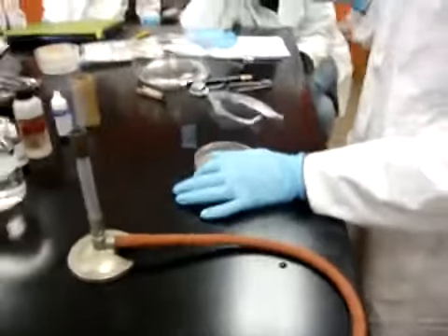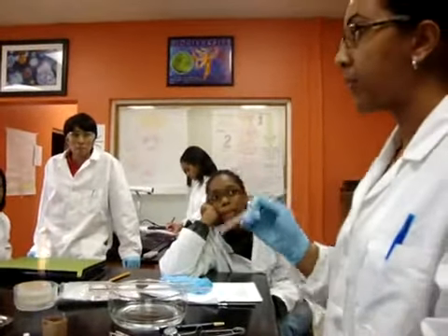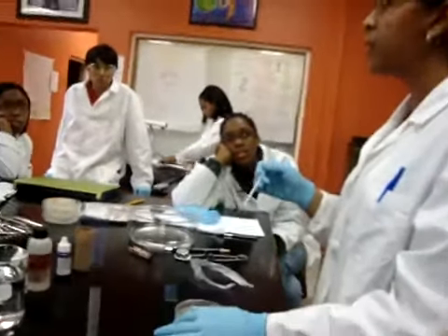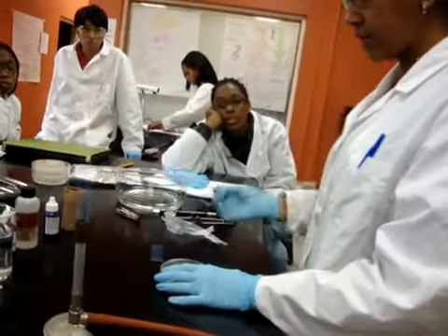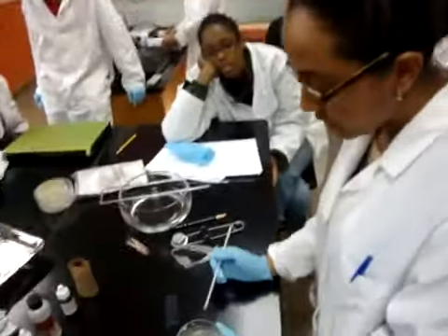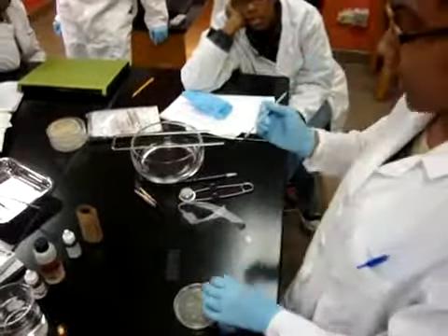Now another thing you want to do is after you flamed your loop, don't take it directly from the flame and put it on your bacteria, because the agar will steam and melt. So just let it cool for a second or two. Now when you do this, you only need to touch the surface of the bacteria like that. Do not go in there and scrape the bacteria off the agar surface.